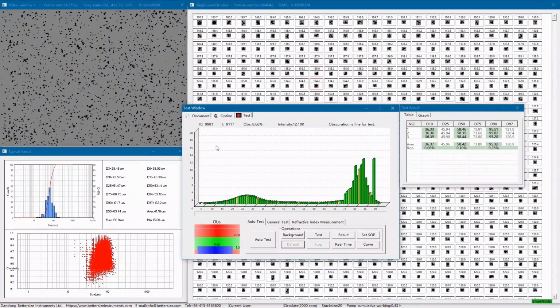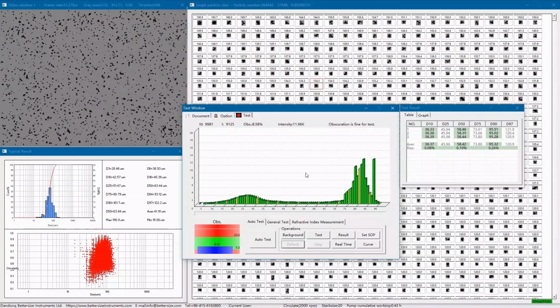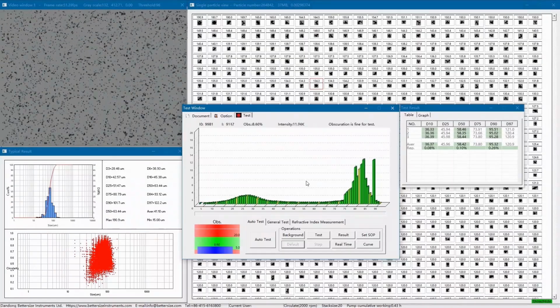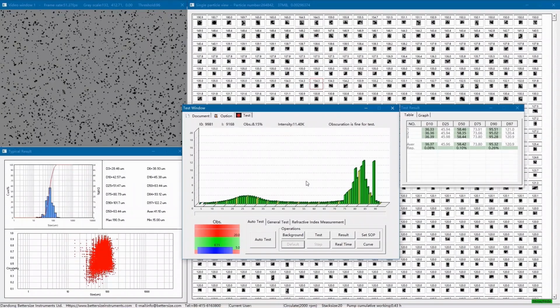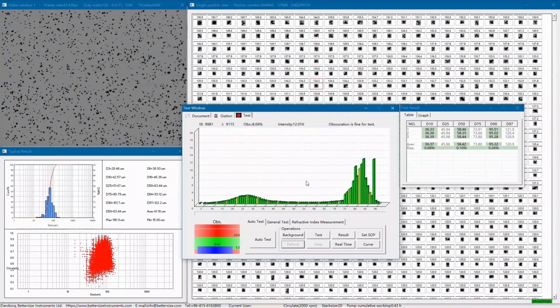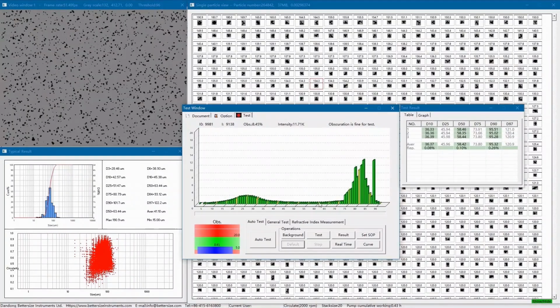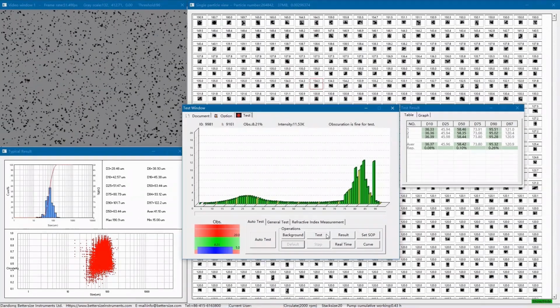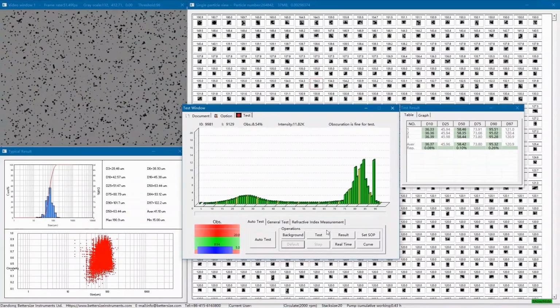Next, we are going to check what will happen if we add a small amount of large and round zirconium beads to the sample dispersed in the Bettersizer S3 Plus. As we know, an exact detection of large particles using laser diffraction is challenging, especially for particles with a broad size distribution, because the majority of small particles dominate the statistics. Then how about the Bettersizer S3 Plus with the combination technique? Can it identify the small amount of large particles successfully? Let's see.